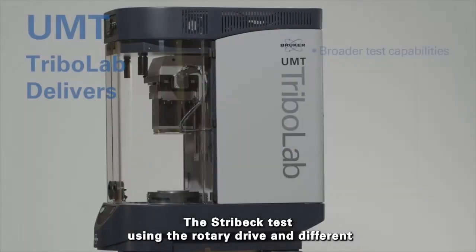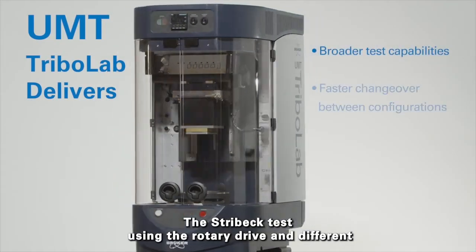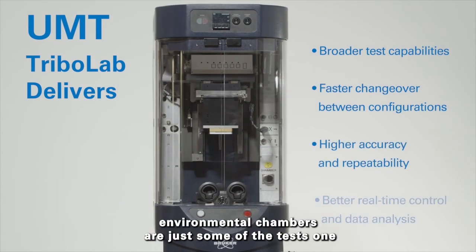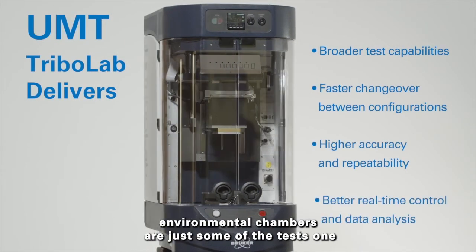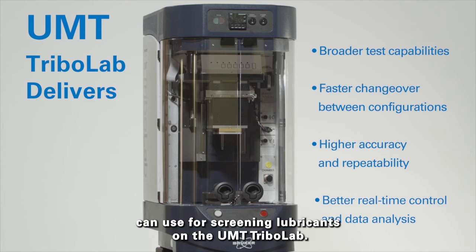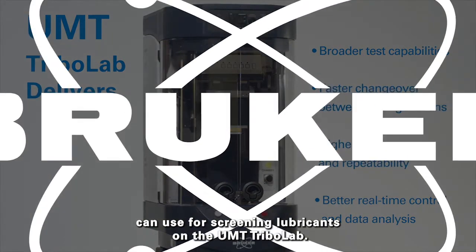The Stribeck test using the rotary drive and different environmental chambers are just some of the tests one can use for screening lubricants on the UMT Tribolab.